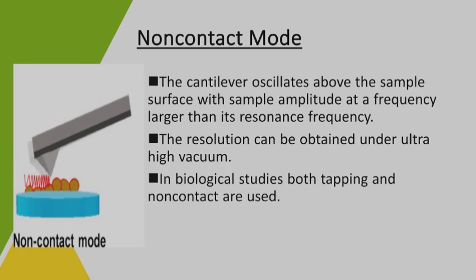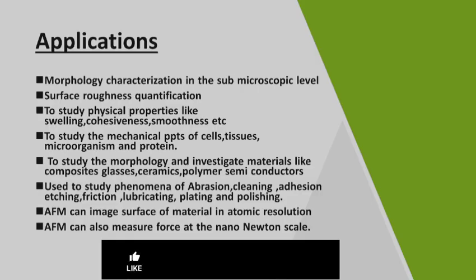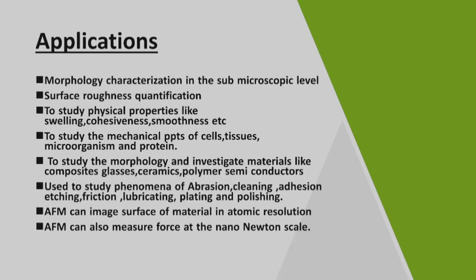In biological studies, tapping and non-contact modes are used. Since we already learned in contact mode that in case of biological samples, the general integrity of the sample may be lost by the tip of the cantilever touching the samples, in case of biological samples only non-contact mode and tapping modes are used.